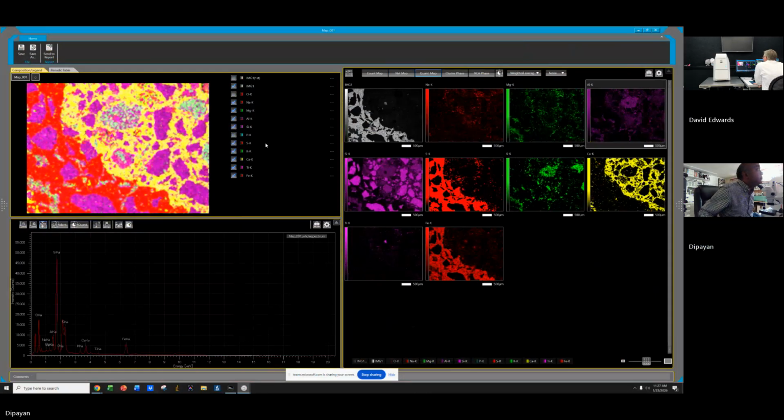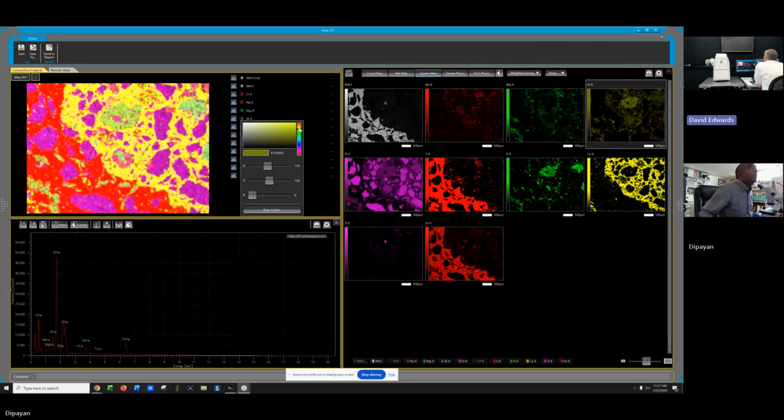I'm sorry? So click the box again. Click custom colors at the bottom. Then click the rainbow on the right where the shade that you want it to be, and then click once you click the shade, now go up and click somewhere in that panel. Anywhere inside that window. Yep.